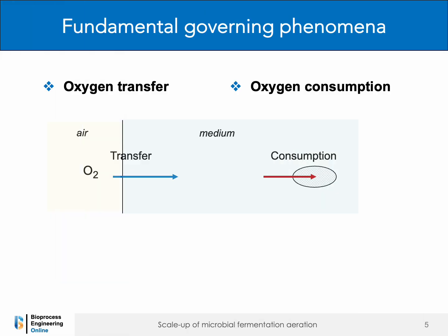In this tutorial, we also examine scale effects by focusing on the fundamental phenomena that govern the aeration process in microbial fermentations. Because oxygen has a very low solubility in fermentation media, the overall aeration rate is most often limited by oxygen transfer from the gas phase to the liquid phase, rather than by gas supply itself.